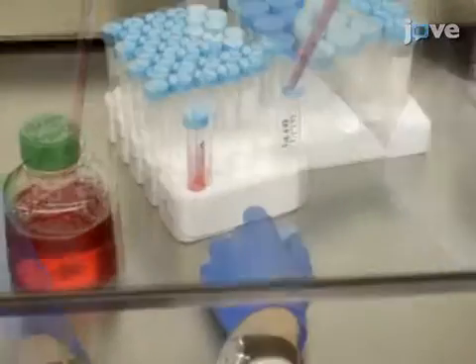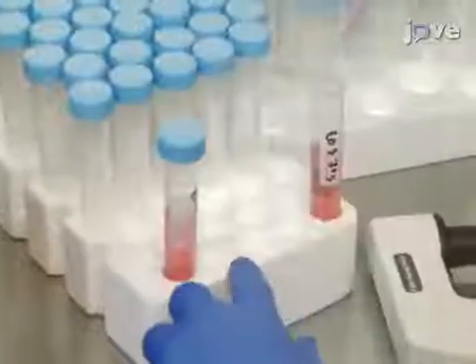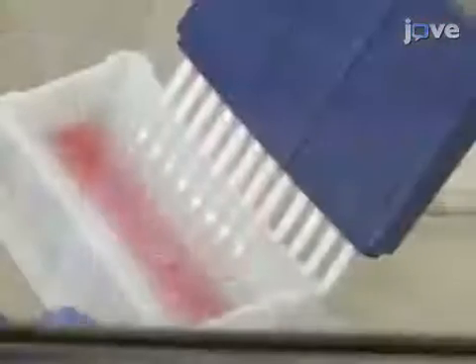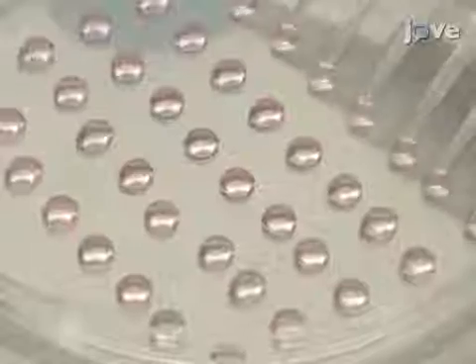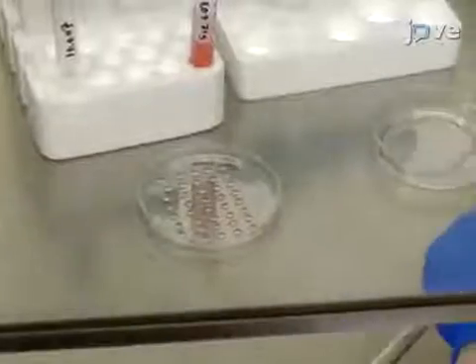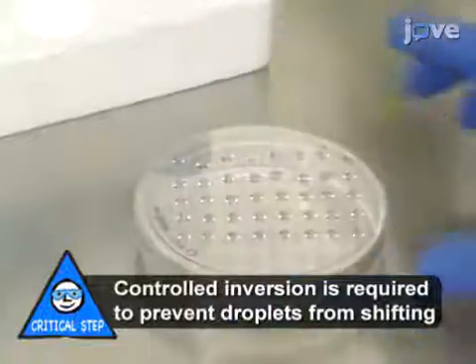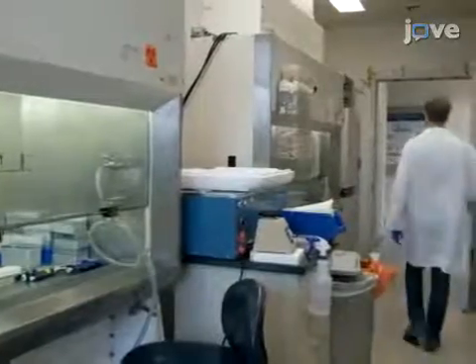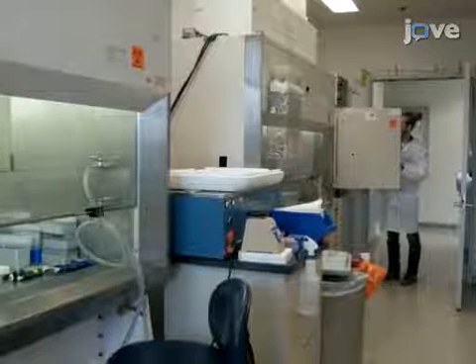Dilute the cell suspension to 500 to 1000 cells per 20 microliters in culture medium. Use a multi-channel pipette to form 20 microliter droplets on the inner surface of a 10-centimeter dish lid, pipetting 5 rows of 8 drops for a total of 40 drops. Next, pipette 5 milliliters of sterile PBS into the bottom of the 10-centimeter dish. Carefully invert the lid and place it on the dish, then incubate the hanging drop cultures at 37 degrees Celsius and 5% carbon dioxide for up to 72 hours to form spheroids.